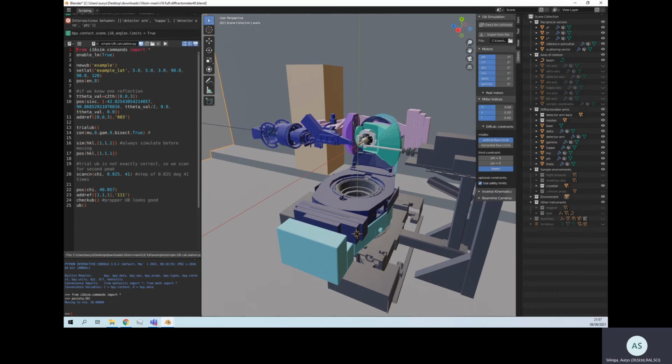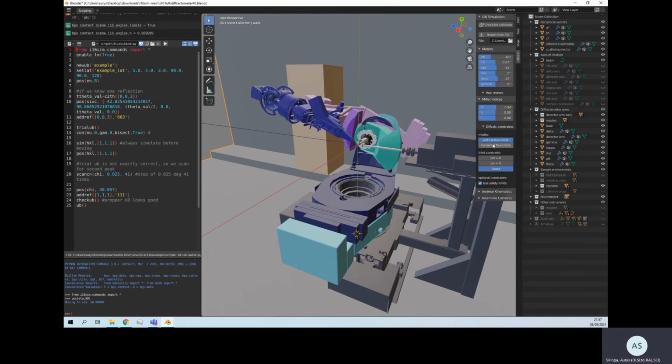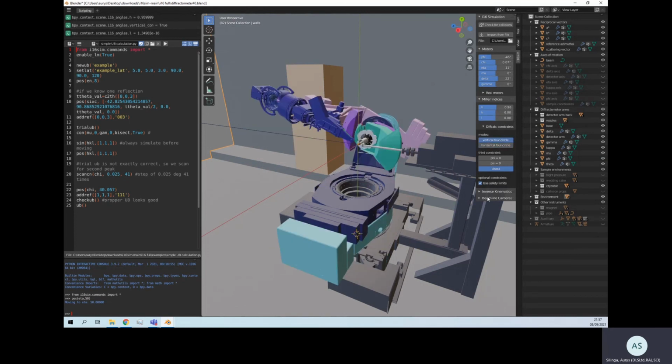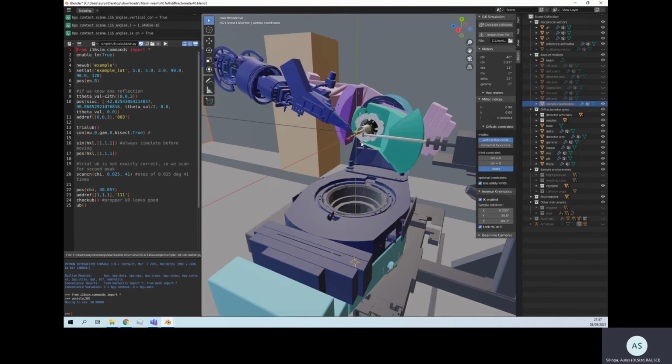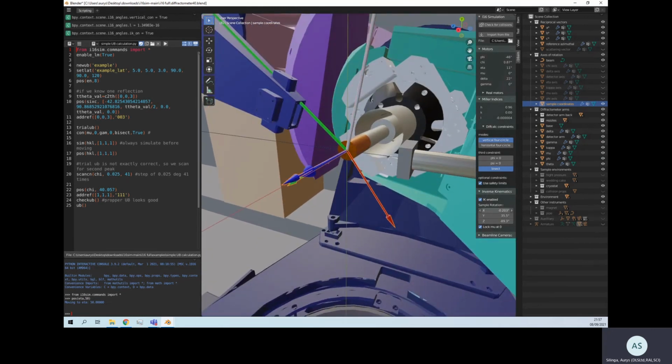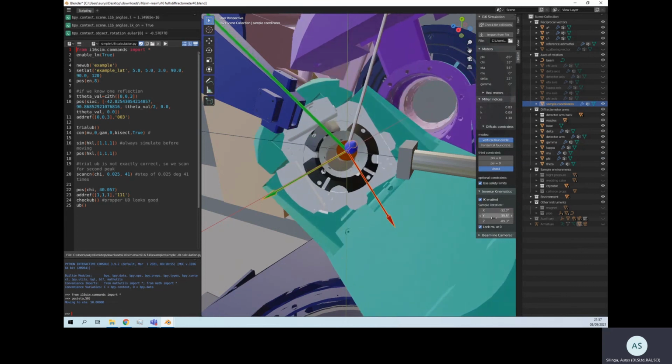Now we have an option to move in HKL space. We can also switch between horizontal and vertical modes of operation. And back. There's an option for inverse kinematics that lets us control the rotation by directly setting rotations in the lab frame.